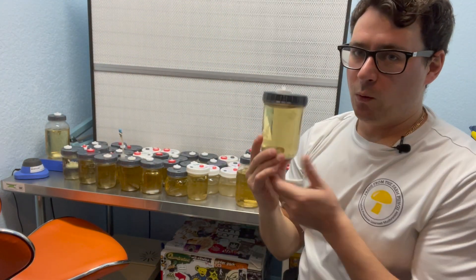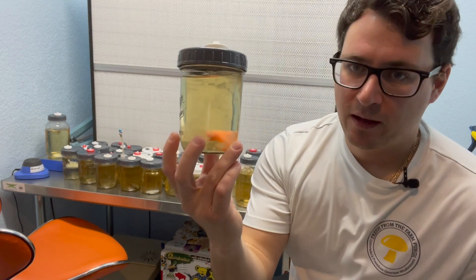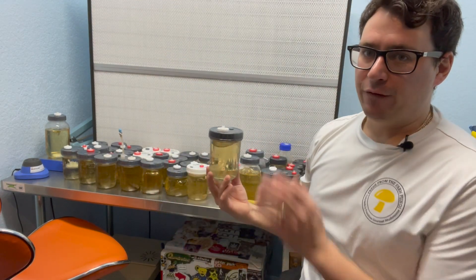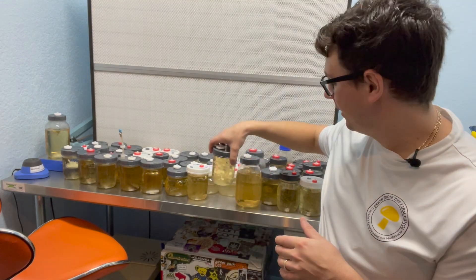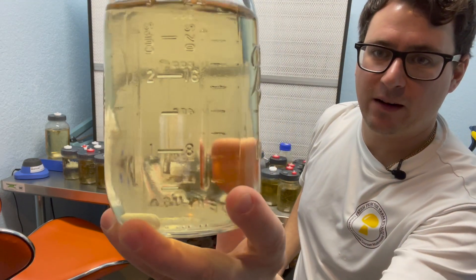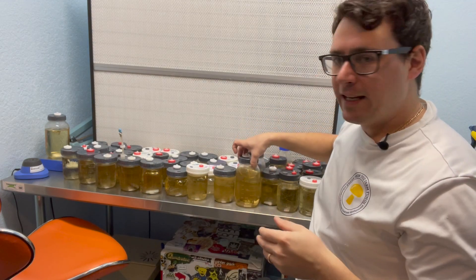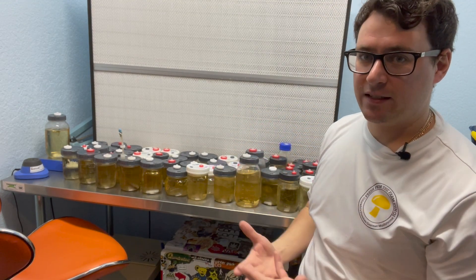So one quality control that we do right off the bat is when we make our broth, we'll let these sit in front of the flow hood for about a week. And as long as they remain relatively clear — like some of these larger bottles, you can see how nice and clear that is — that ensures that the liquid broth is in fact sterile.